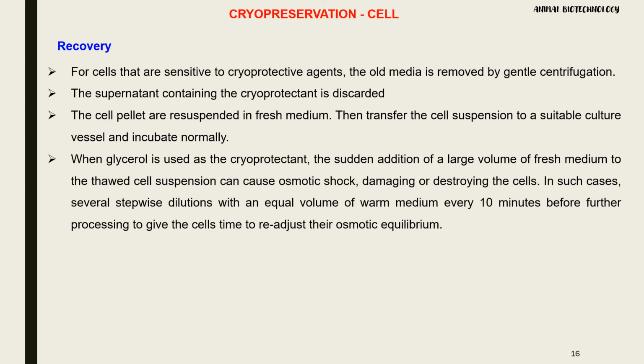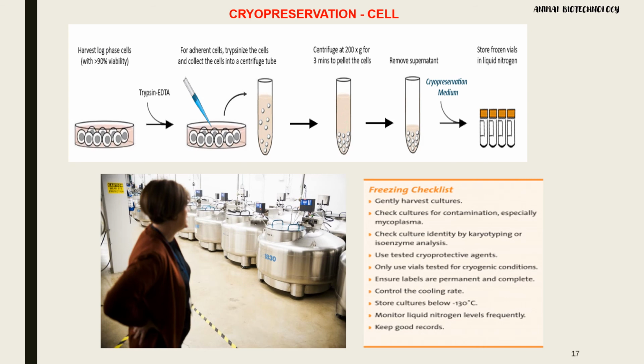After the recovery, the viability of the cells is checked by using different dyes and the viability percentage is calculated. The figure here outlines the different steps taken for cryopreservation of cells and a certain freezing checklist.